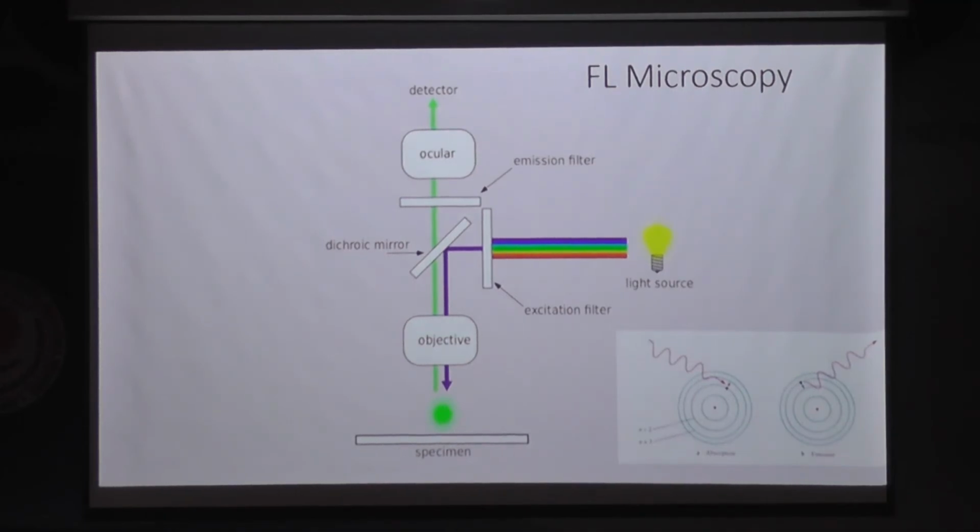Energy is neither created nor destroyed. It just transforms from one medium to another medium. That is how it is. So what happens? The light source is generating the light. It is falling onto this fluorophore. Once the fluorophore absorbs this light, it gives back light, and this is seen through the dichroic mirror, and then that is detected through the eyepiece.